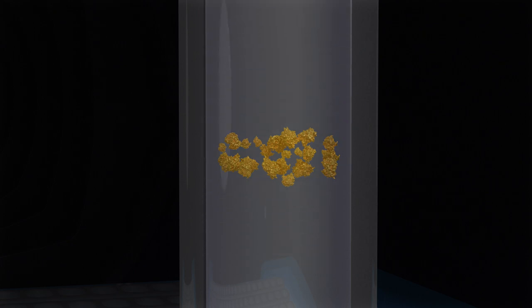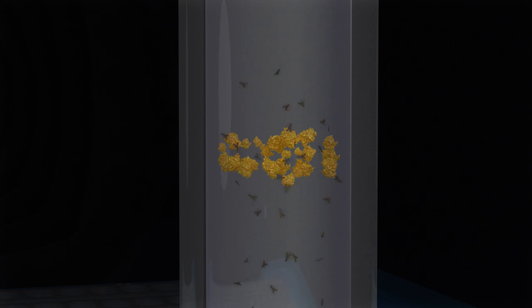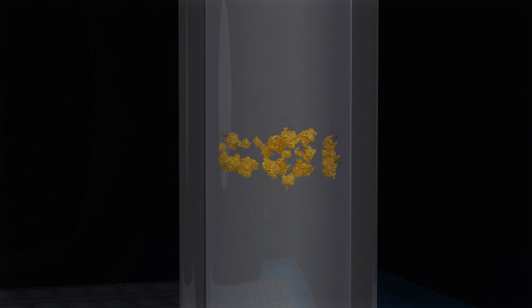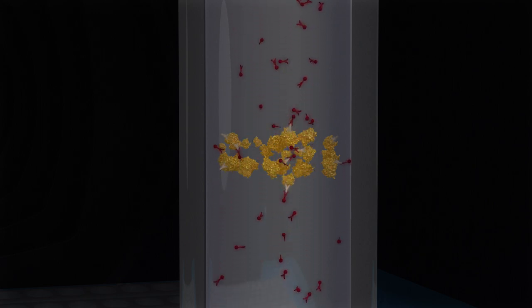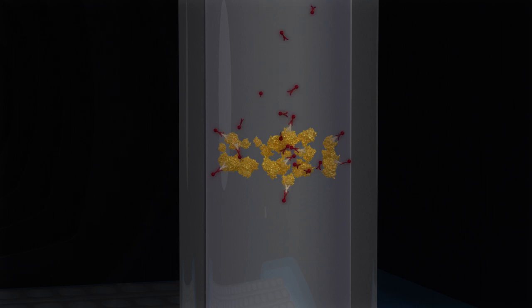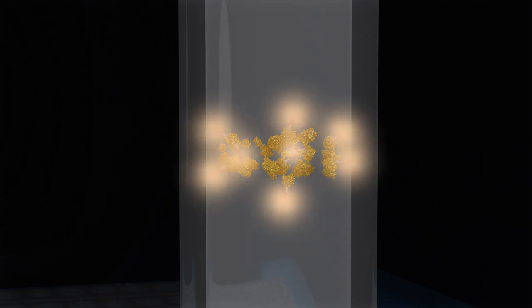For chemiluminescent detection, samples are first incubated with the primary antibody, followed by a secondary HRP conjugate, and finally chemiluminescent substrate. The chemiluminescent reaction is recorded by a CCD camera in a series of images over time.